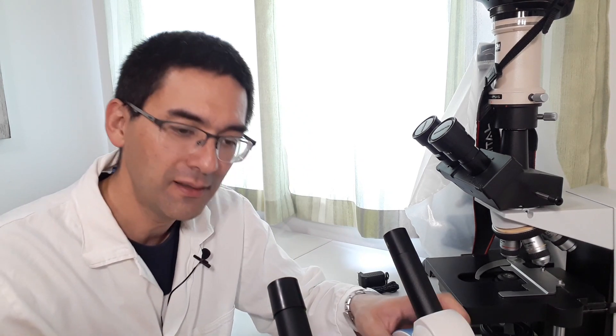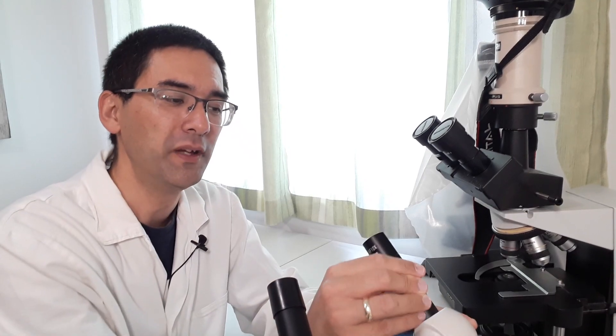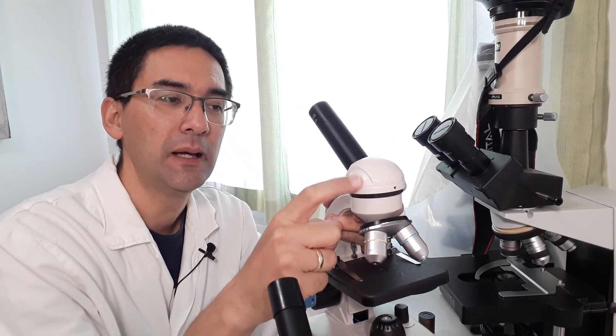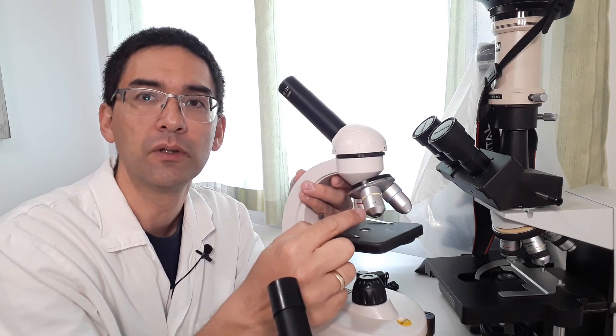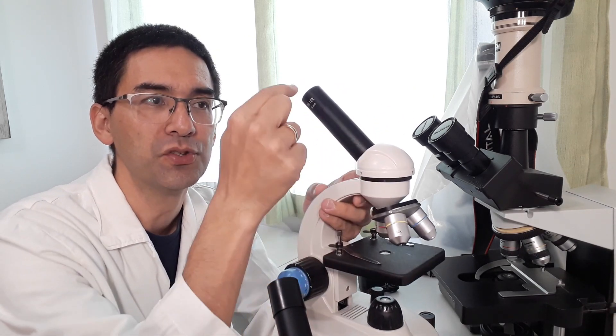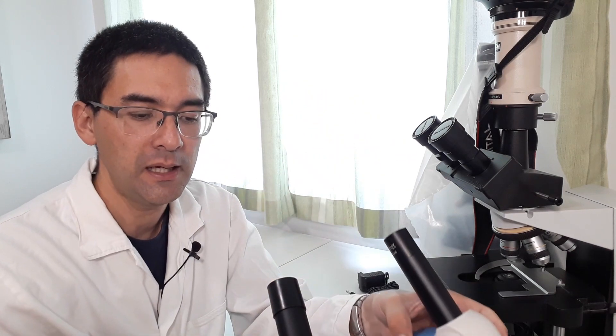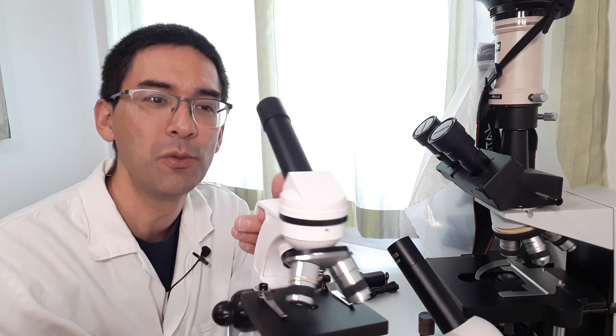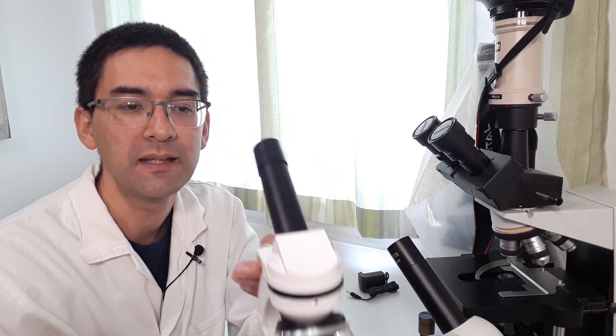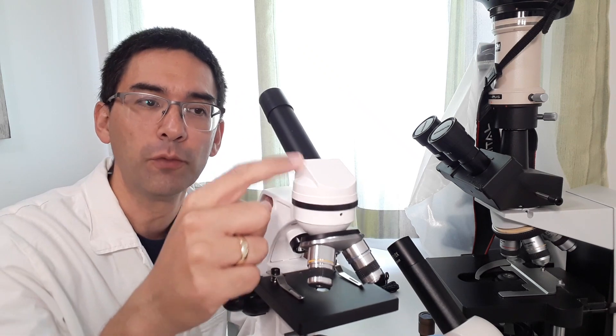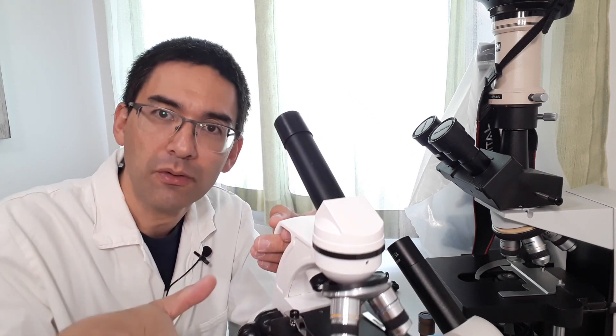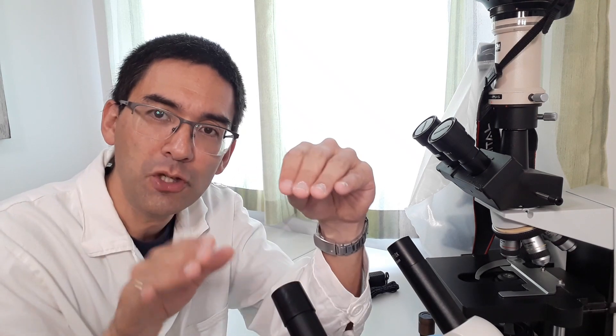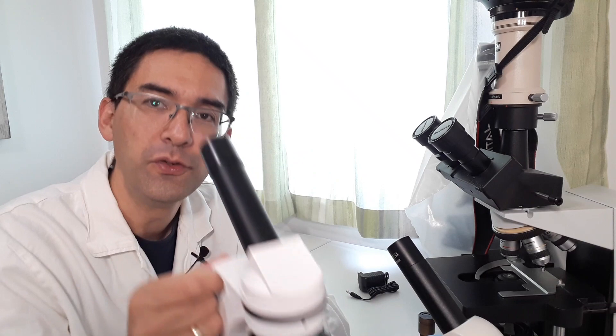And yet another difference is, and I actually checked by removing the tube here, this microscope has actually the prism in here to redirect the light. So the image goes up here and then this goes across here. And there is a prism here. And here we have a mirror. Now, who cares, you might say, there is a difference. It is like this that this microscope gives you, therefore because of the mirror, an image which is a mirror image. And this means that if you rotate the slide to the left, then the image will rotate to the right. And this is a little bit confusing here.